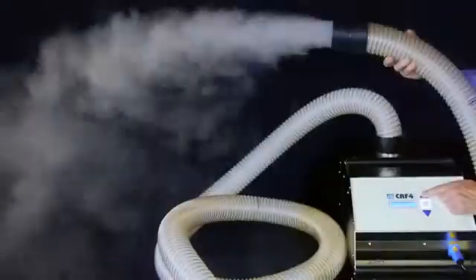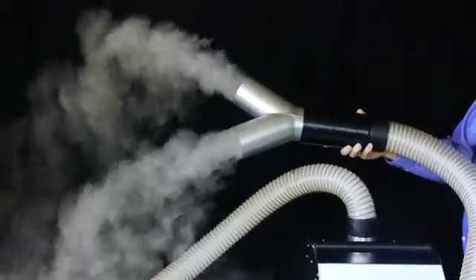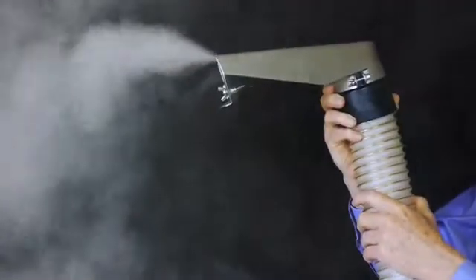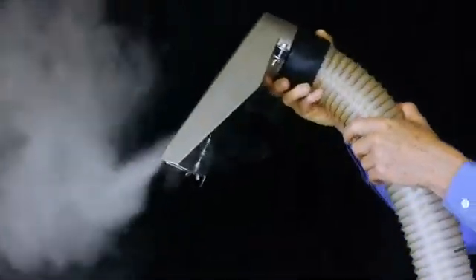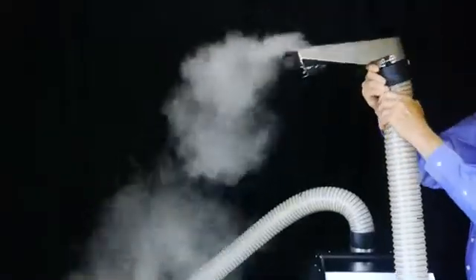The fog density is 170 milliliters per minute, the highest fog volume of any ultrasonic fogger in the world, enabling visible fog out to 15 feet to visualize airflow patterns, turbulence, dead zones, and equipment exhaust. Up to 45 minutes or 90 minutes of fog operation is provided depending on the fog volume selected.